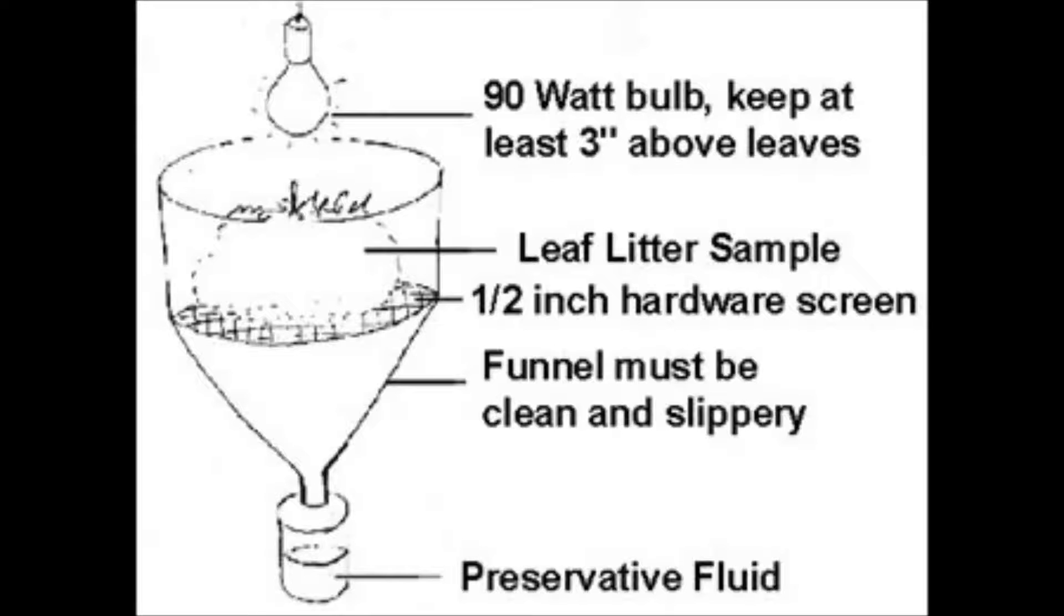In this video, I'm going to show you how to make two different types of extractors to get microarthropods out of leaf litter or soil samples using the heat created by a light bulb to push them down into a funnel and into your collection cup.